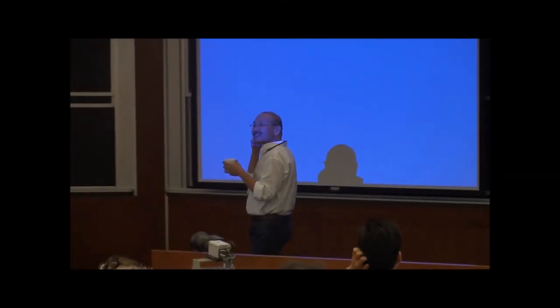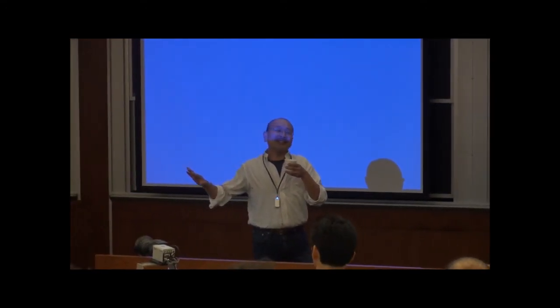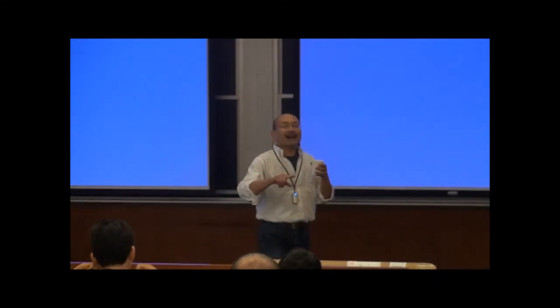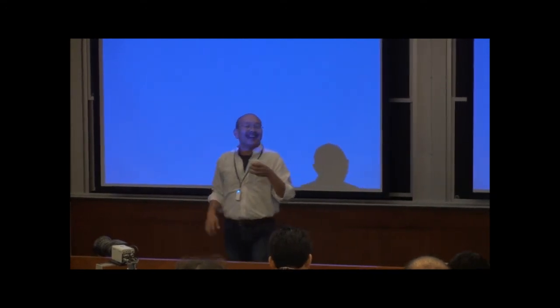So today, I guess it's a 1-2 punch. It's me and Dipan, and everyone knows Dipan too, because he has been helping you for the last week and a half. I am going to tell you a few methods of doing 3D imaging based on very traditional methods of confocal and multiphoton and a little bit of second harmonic generation. This afternoon or tomorrow afternoon you will go into the lab and try some of those systems out. We'll show you how to push a few buttons to get it to work. You're not going to build that.